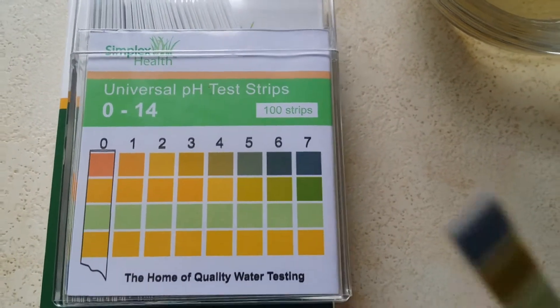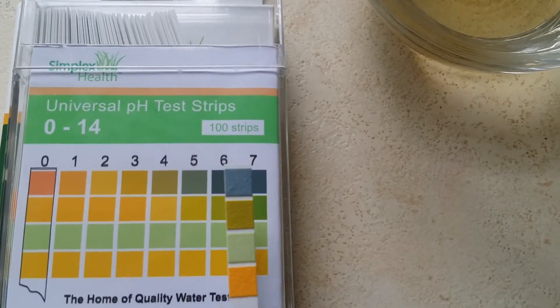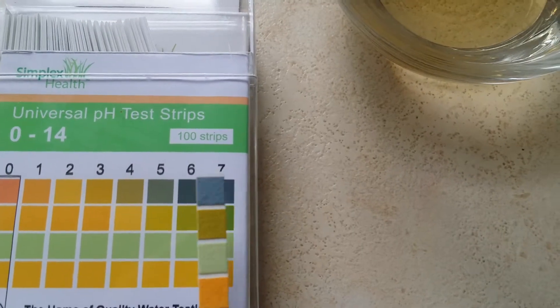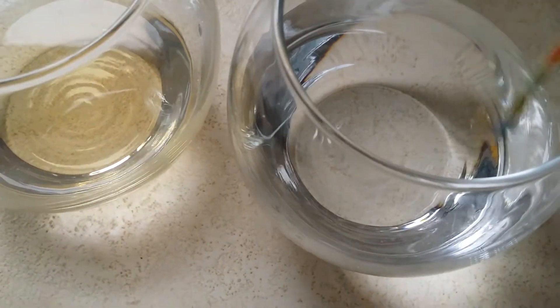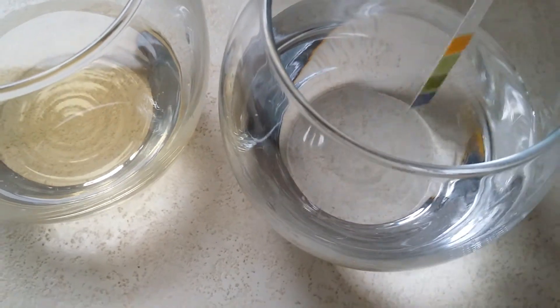So let's do the water now. As you can see, the strip is already quite blue on the top, then brown, then green, then orange. The strips won't change drastically, and we're looking for a neutral pH of around about 7. This is drinking water. Anything that's not around 7 isn't particularly a great thing.